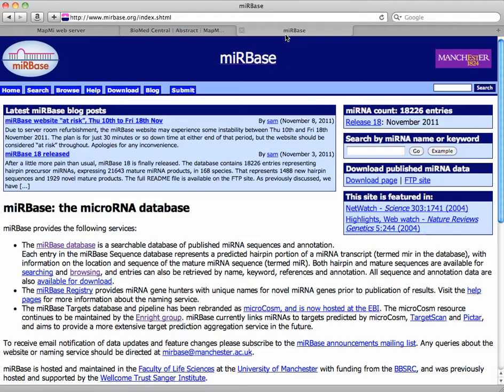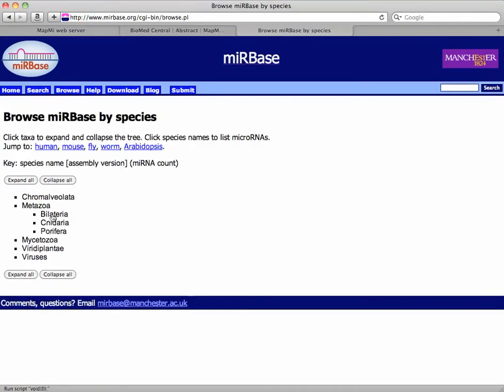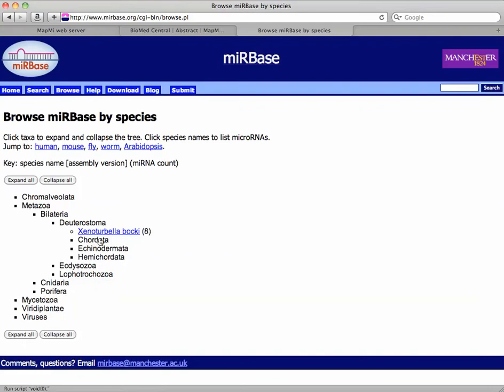I'm going to go to MIRBase and cheat a little bit. I'm going to browse and I'm going to find dog. Now this will test your ability for clades, figuring out clades: bilatera, deuterostoma, chordata, urbata.